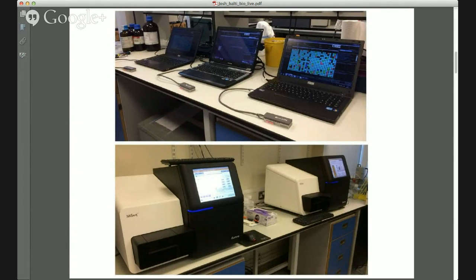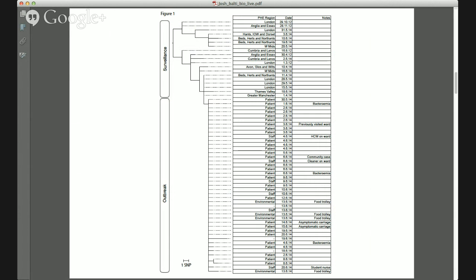So we had 14 identical strains. We had 2 which had 1 or 2 SNPs, and they were associated with in-host evolution. So then we decided to take one outbreak strain from the ones we sequenced and one non-outbreak strain, and we sequenced them on both R6 and R7 on the MinION. And this is just to show you that of all of the isolates that we sequenced, the outbreak was quite closely related to isolates that had been seen in Manchester, Thames Valley, and others in London.